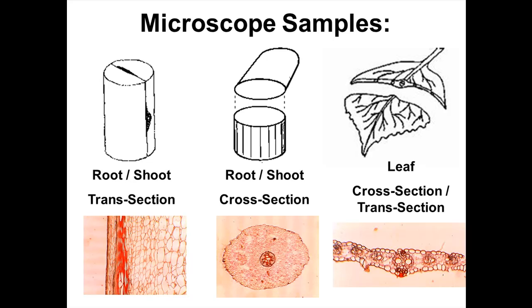Alright, I'm going to take you guys through how to identify cell types and tissues when looking at a transverse section of a leaf. Something you should be familiar with for the prac assessment and also the cells, and probably even later the transport and plants topic.